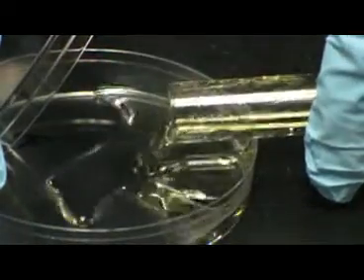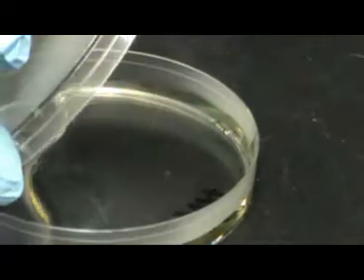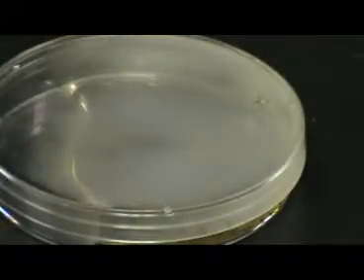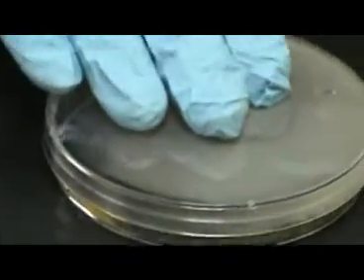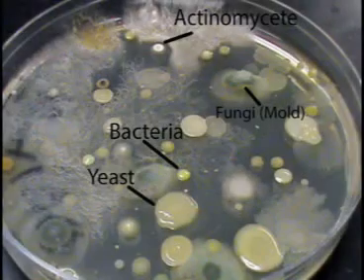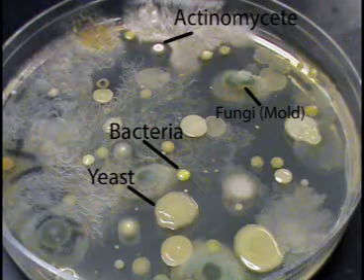Once the agar has been poured into the plate, you should replace the lid and gently slide the plate in a short figure 8. This will ensure mixing and spreading of the media and sample. Soil plates show great diversity of organisms. In this particular plate, we can see an actinomycete, a mold, a bacteria, and yeast.